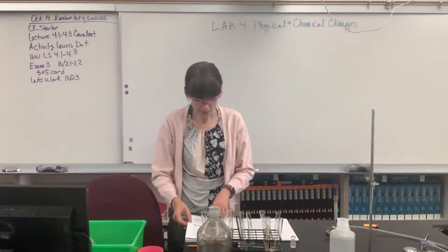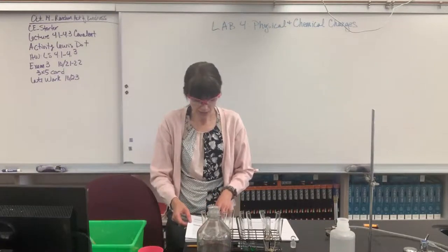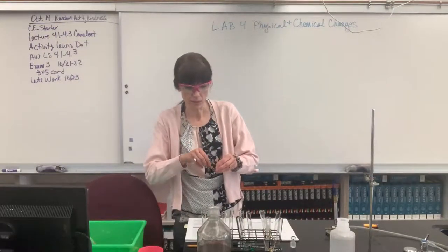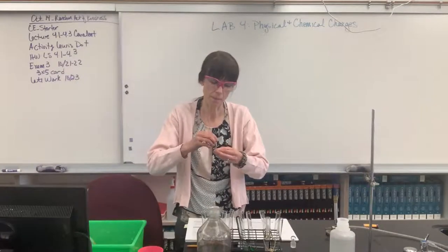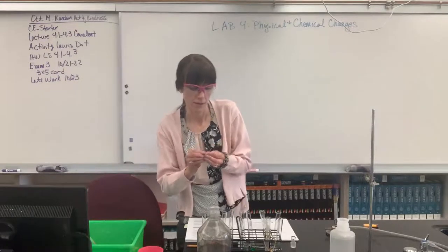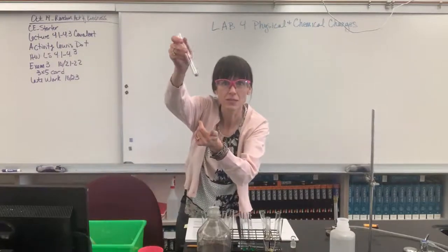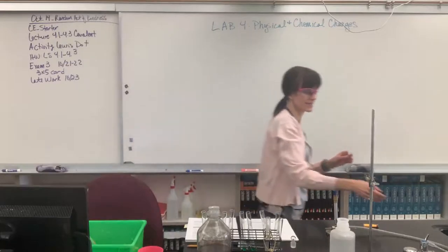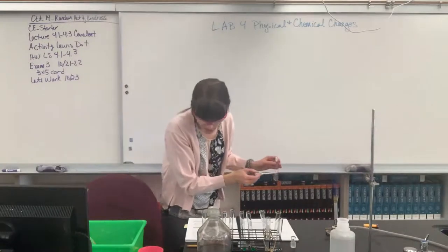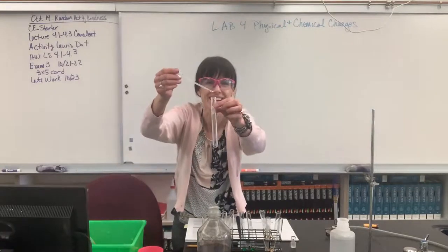It says place 1 strip in a small 10-centimeter test tube and cautiously add 10 drops of dilute 6 molar HCl. Okay, so to get this to fit in the test tube, I am going to wrap this in a little circle. And then I'm going to put this in the bottom of a test tube. So I have that shiny metal in the bottom of a test tube. You can maybe barely see it. And now we're going to add our HCl. I have to read again how many drops it said. We are going to add 10 drops. Okay, here we go, you guys. Get ready.